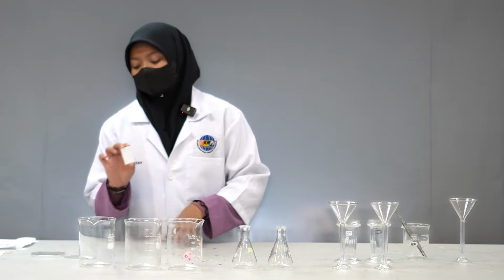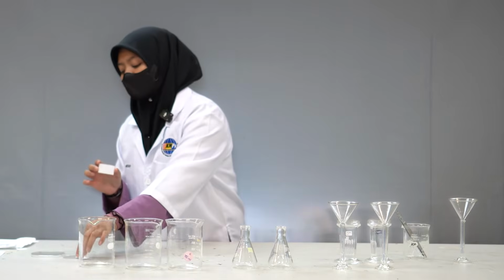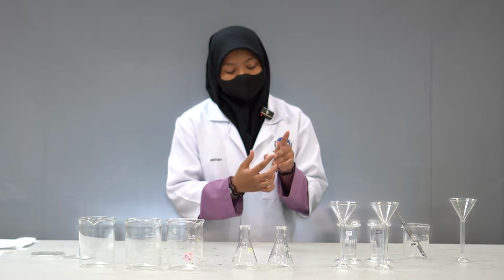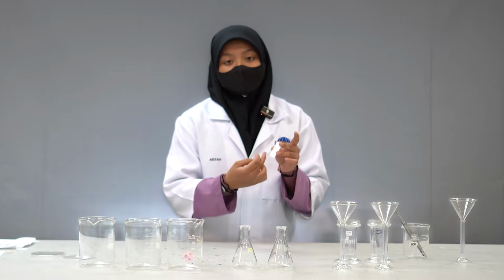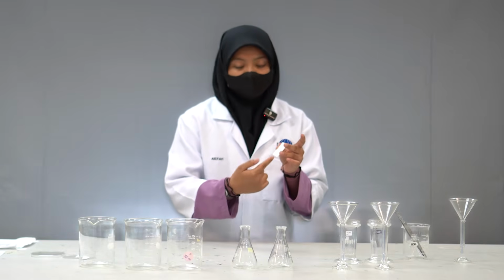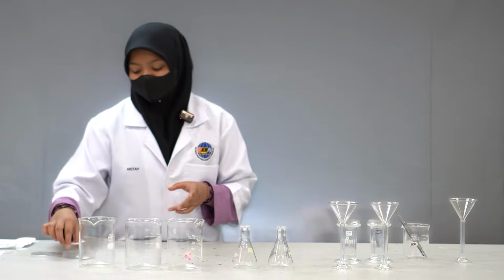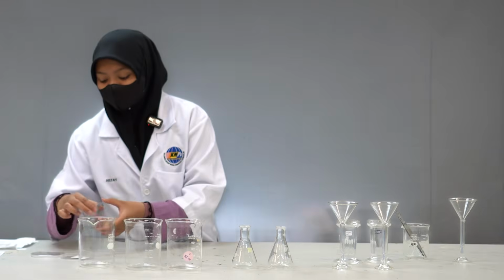We take these two thin layer plates and label them 1 cm from the bottom and top using a ruler and pencil. At the bottom section, we have 3 sections: A for acid, B for base, and N for neutral. Then do it for both thin layers, okay?